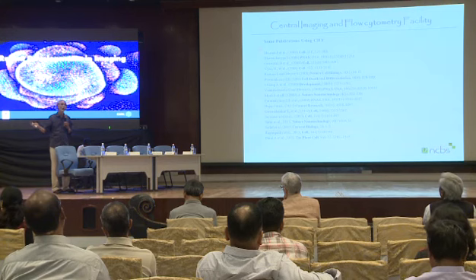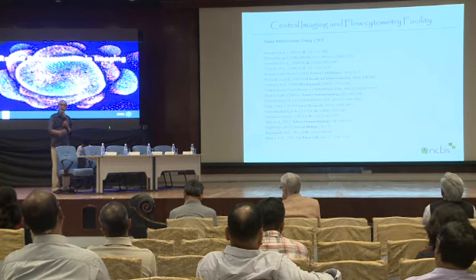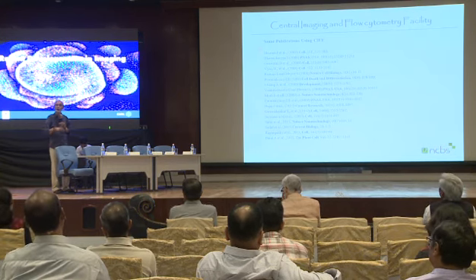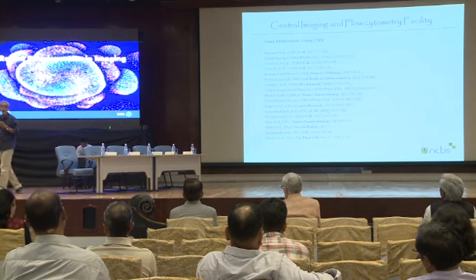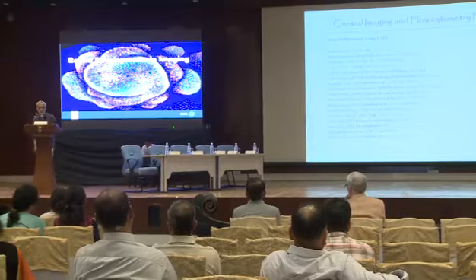Now we have helped so many plant companies. They bought their own cytometers. They are doing the ploidy analysis, and they can easily find the double haploids. These are the key achievements of our facility, apart from helping the scientists do good science and publish papers. Thank you very much.